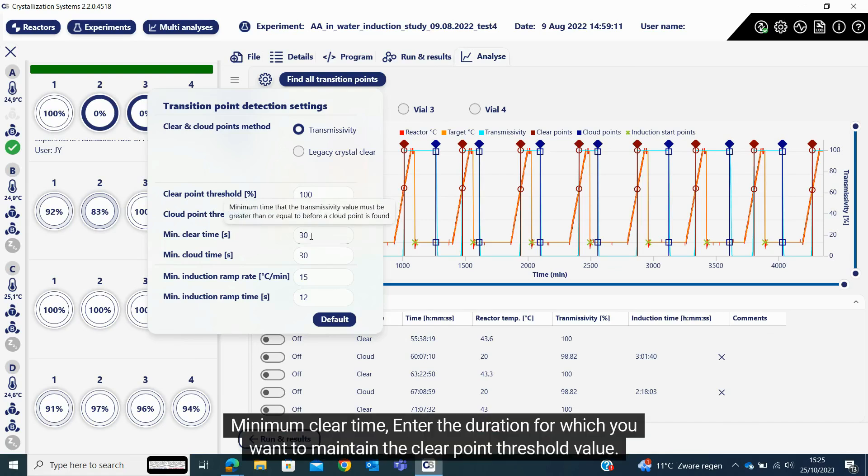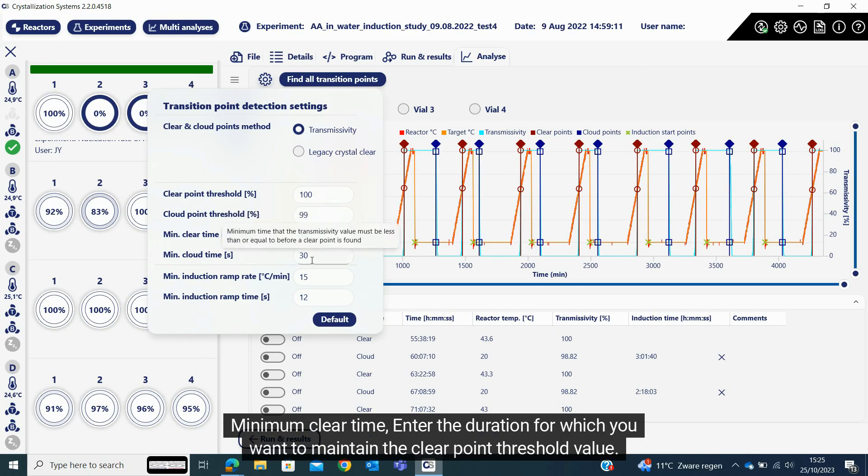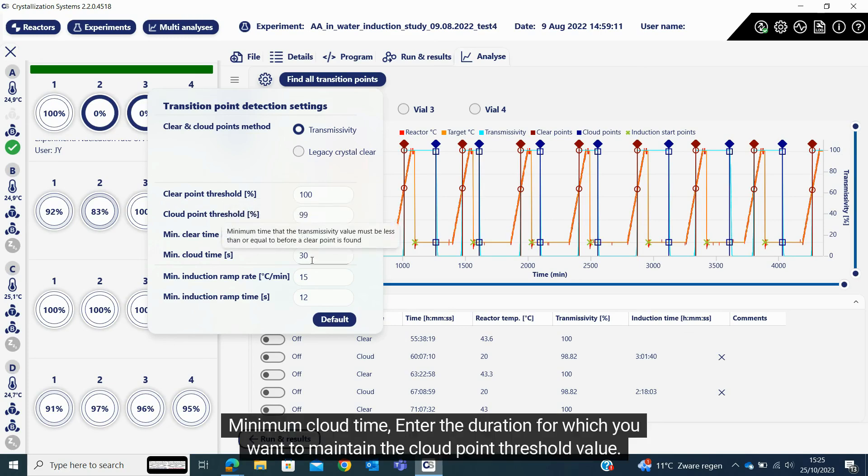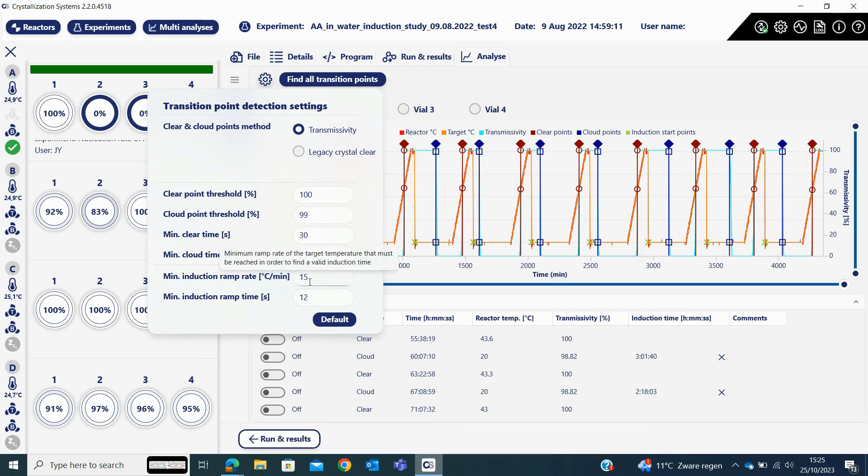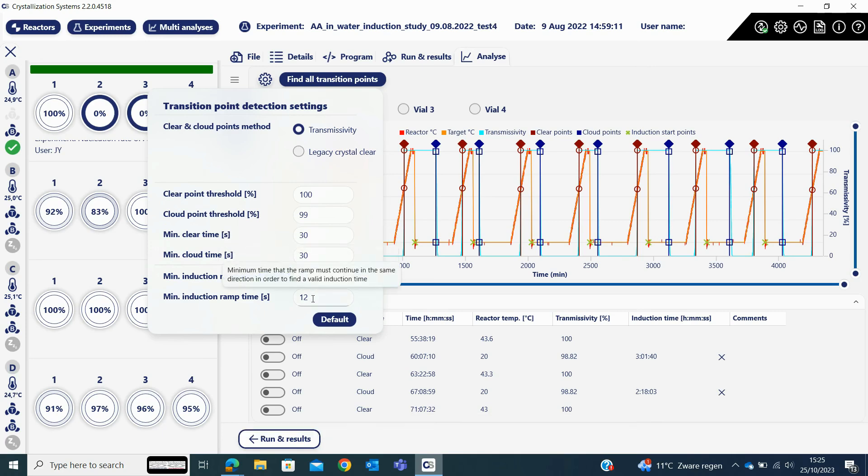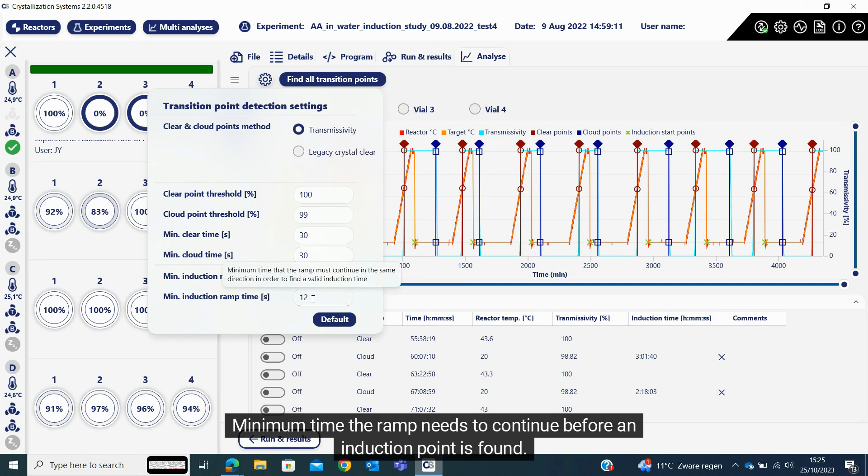Minimum clear time: enter the duration for which you want to maintain the clear point threshold value. Minimum cloud time: enter the duration for which you want to maintain the cloud point threshold value. Minimum ramp rate to find an induction point and minimum time the ramp needs to continue before an induction point is found.